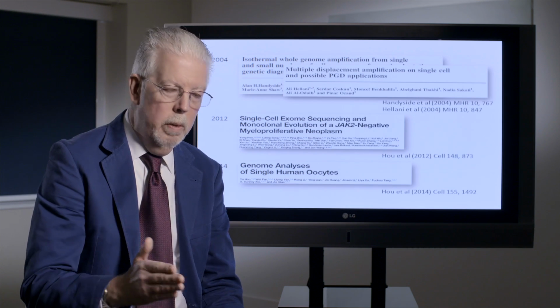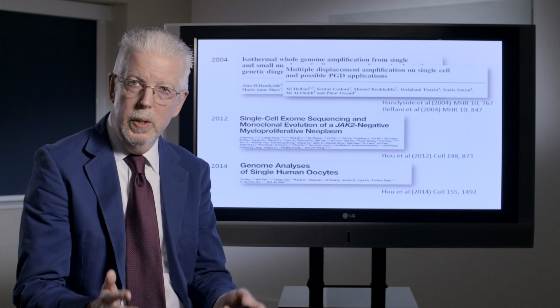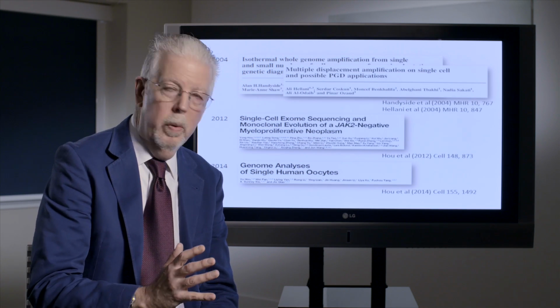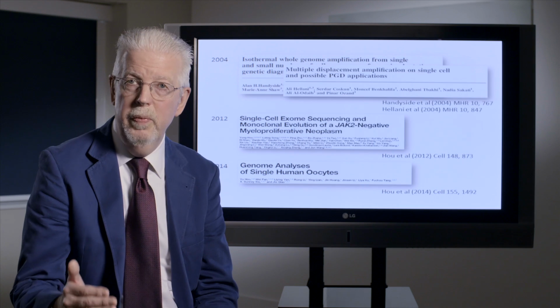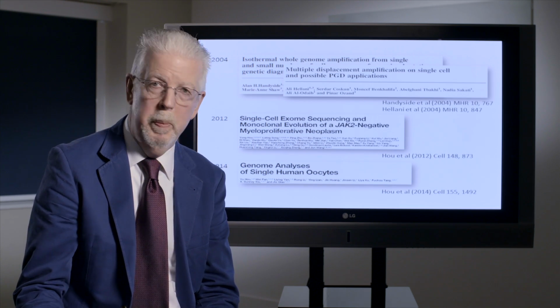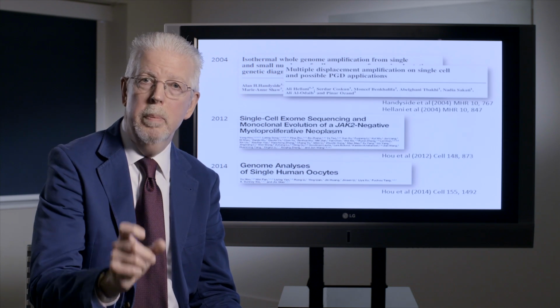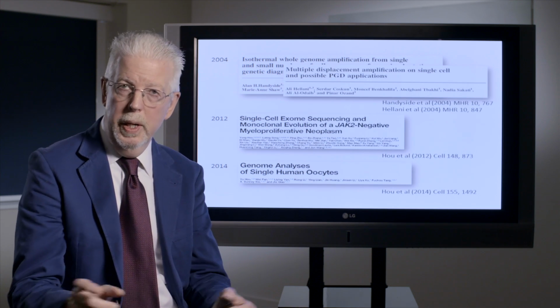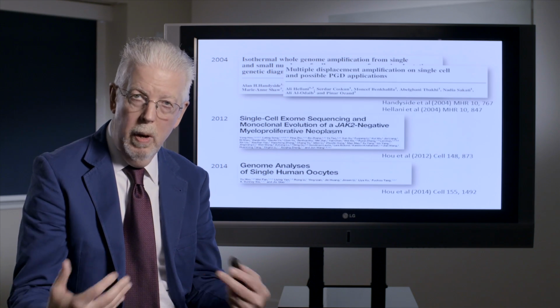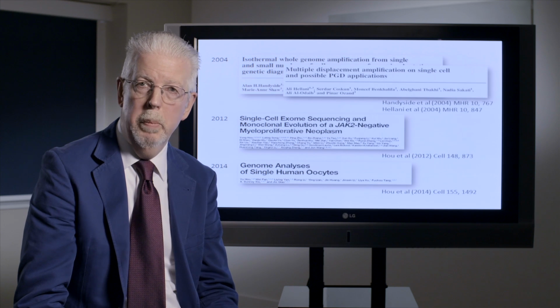And so already we were dreaming, if you like, about using genome-wide platforms, using this DNA, to overcome what are still today the deficiencies. So I should say we haven't overcome all of the problems, because still, when we amplify the whole genome, there are gaps. And we'll see that the strategies that we now use the power of genomics to actually get round those technical issues and nevertheless give us very accurate and powerful tools.